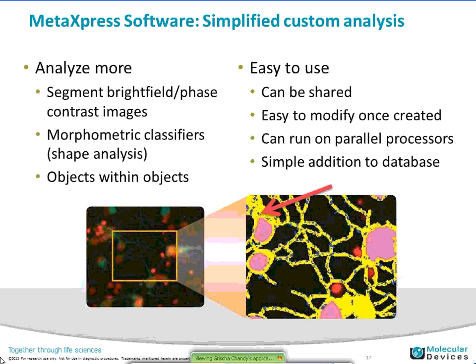With the new version of MetaExpress, there is the ability to generate custom modules. This allows you to analyze bright-field and phase contrast images, do some morphometric classifiers, and create modules that allow you to do things like finding objects inside objects. In this example, we're looking for puncta inside neurons or near the cell body, and those little blue dots are being found along those neurons. Once a custom module is created, it can be shared, it's easy to modify, and it can be run with MetaExpress PowerCore for parallel processing. Once created, these settings can be added to the database.